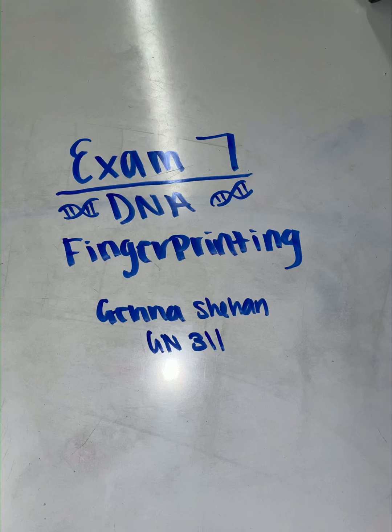In our last video of the semester, we will be studying DNA analysis through the use of gel electrophoresis.